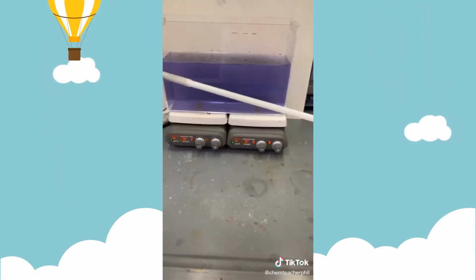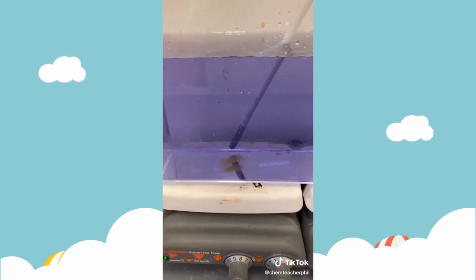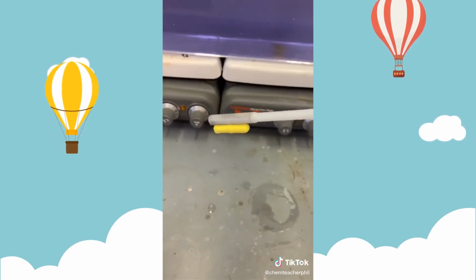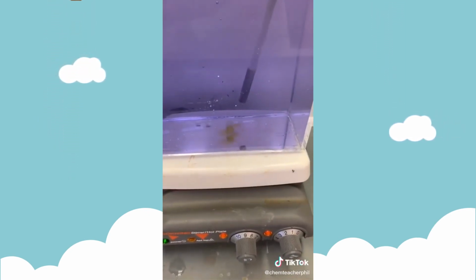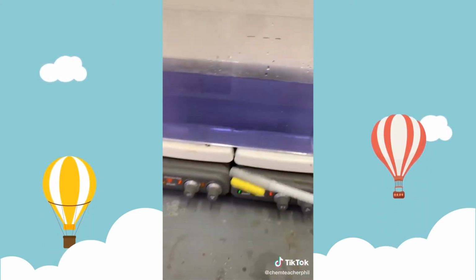That's the next one. In a lot of the videos that I post, you see me use a magnetic stirring bar. I want to show you how we actually get the magnetic stirring bar out after a demo's over. You use a retriever, of course. Just like that.